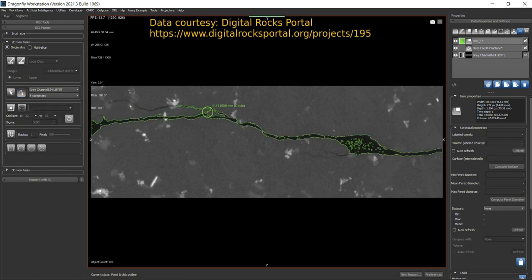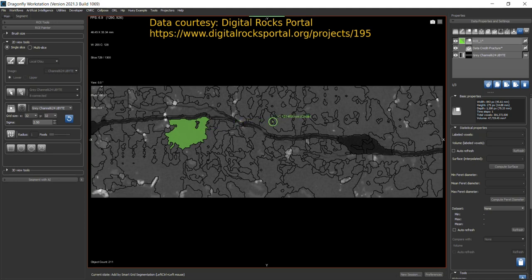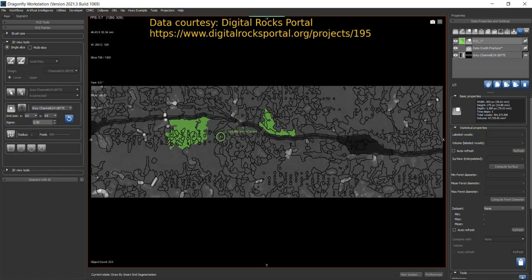The Point and Outline Tool gives just the outline pixels. Click and you can paint only the outline pixels of the ROI. The Smart Grid Tool decomposes the image into superpixels and helps you fill region boundaries. You can change the size of the grid, and there are many options available.